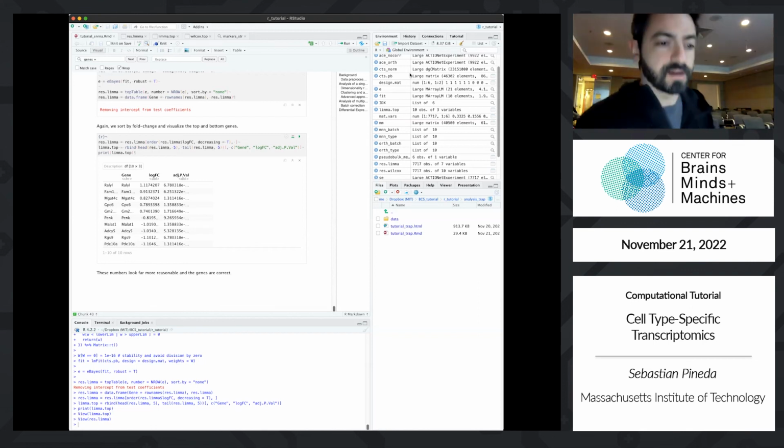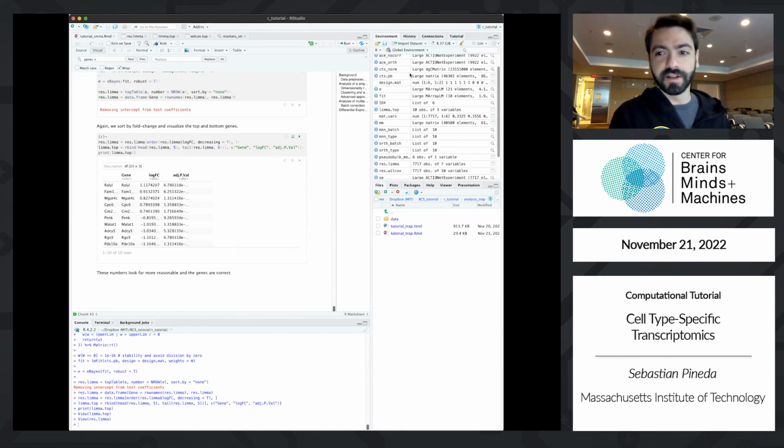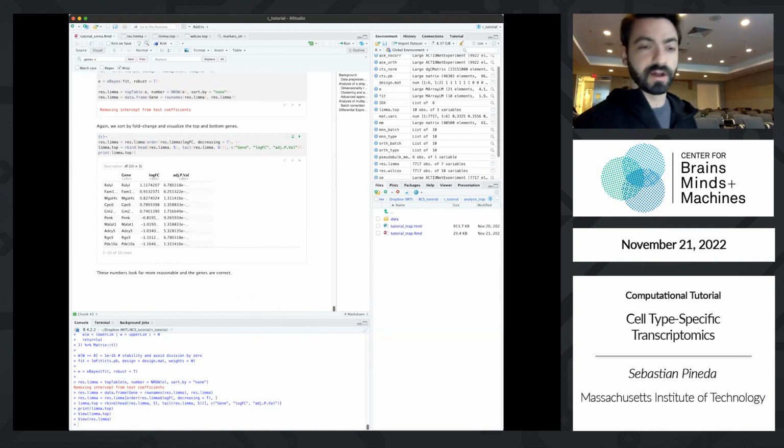Hi, great talk. Thanks. Very informative. I have two questions about RNA-seq. Our lab has done single nucleus RNA-seq between two neuron types, and we're trying to find which genes are most differentially expressed. We have all these log fold changes, and something my PI wants to do is to unlog them, because it's much stronger to show a value change of 8 versus 64 than 3 and 6, which is the log. Can you do that, or are there problems from the log fold shrinkage in the pre-processing that would bar you from unlogging?